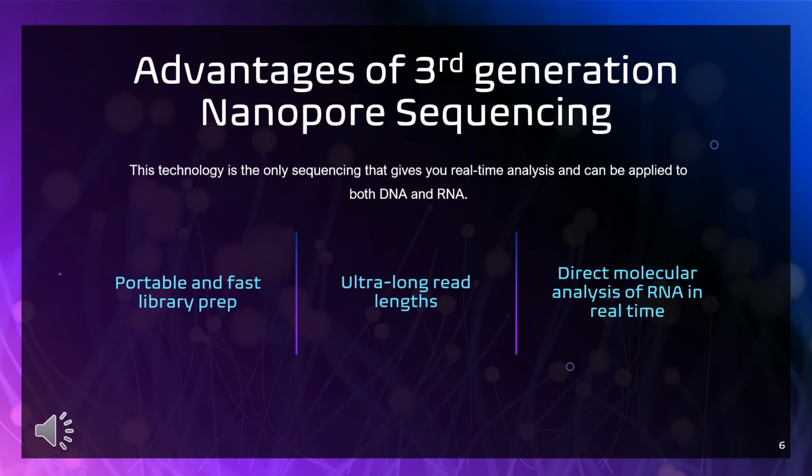Nanopore technology can also process extremely long reads. The MinION specifically has been able to process a read greater than 4 MB in length, although 1.2 MB max is recommended. Other devices such as the PromethION can handle ultra large reads, but the PromethION, this is not a compact device, that was a lie, sorry, is the one that you would find in your lab space. You wouldn't want to take that one with you. It costs a lot of money too.